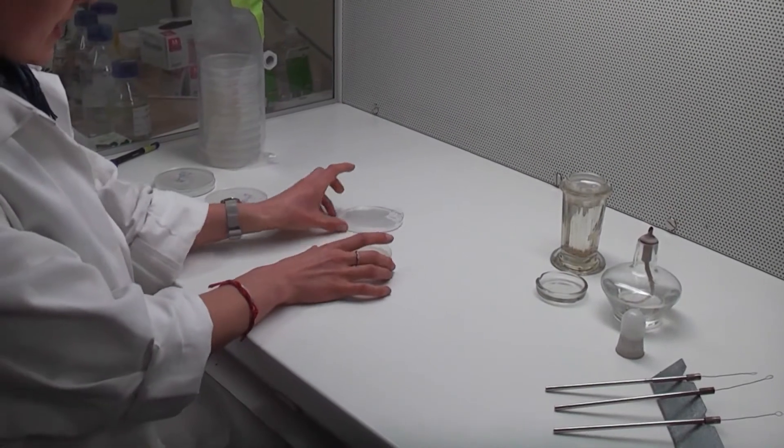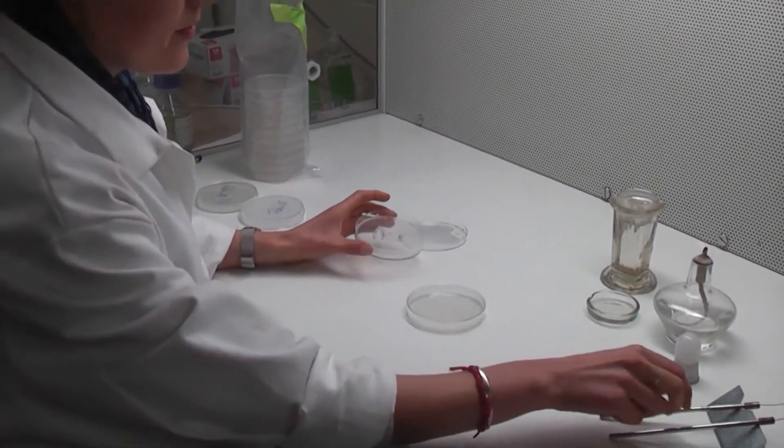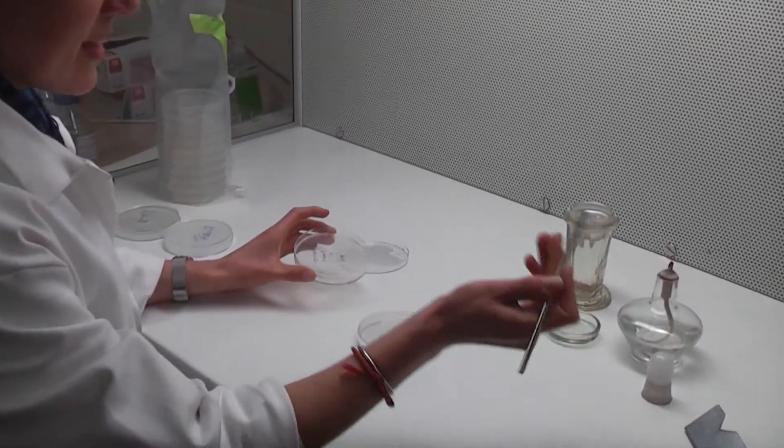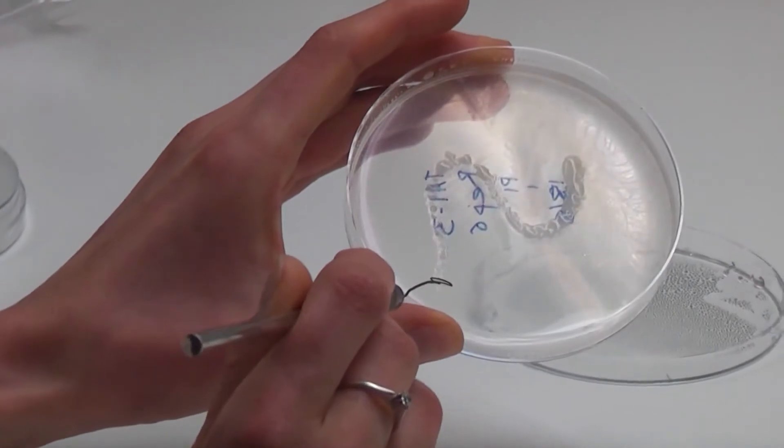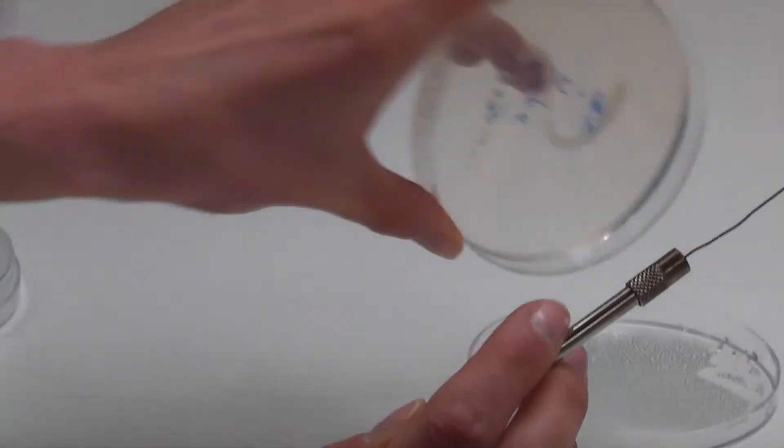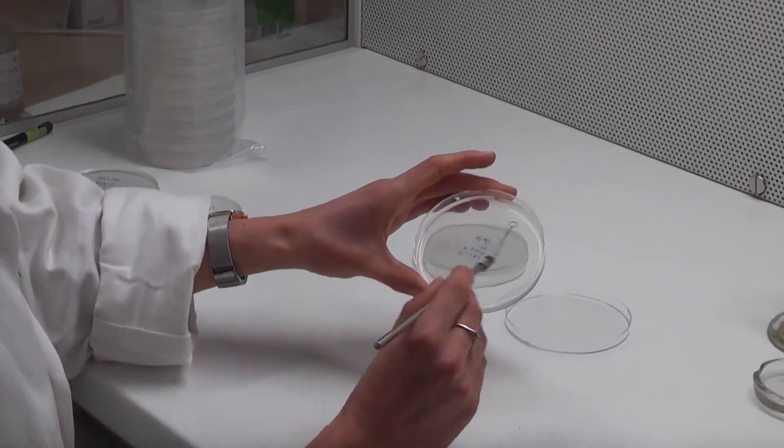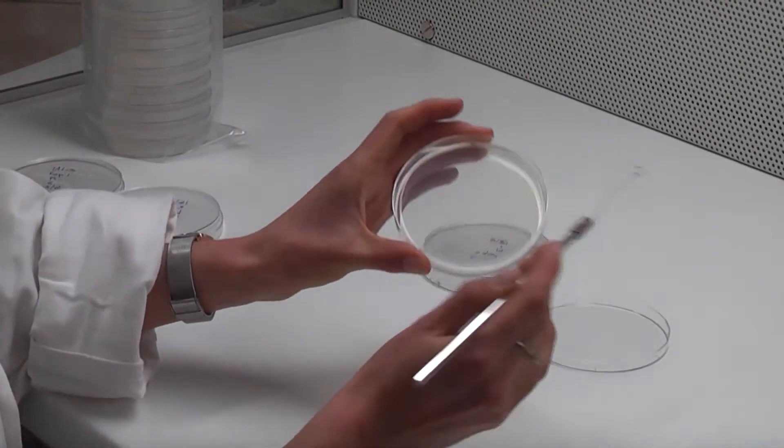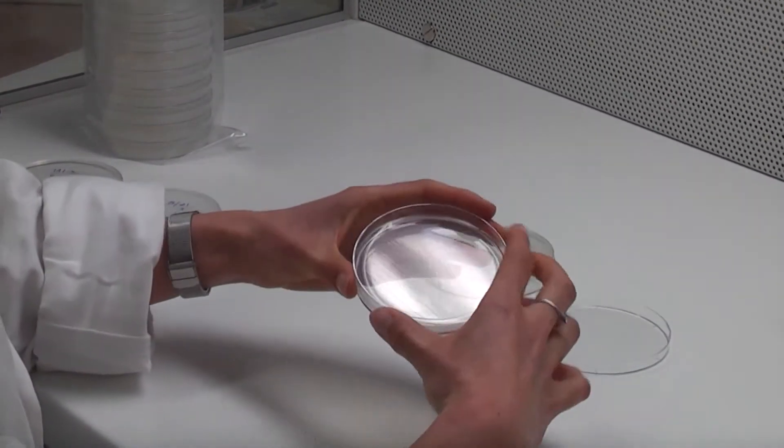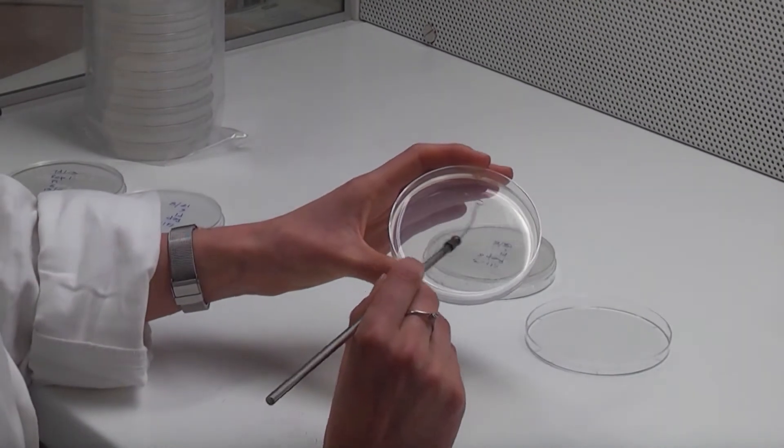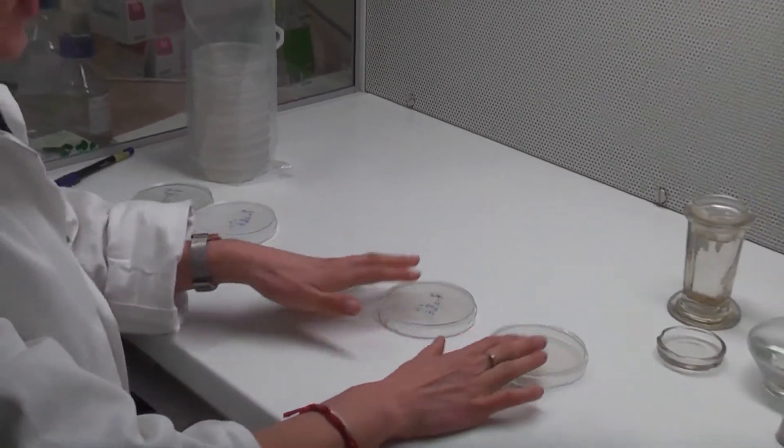So to clean this up, we get a fresh yeast mannitol agar plate and one of these sterile loops, and then we dip it into a clean part of the plate and just streak it. First like this, and then like this, and finally like this. And as easy as that.